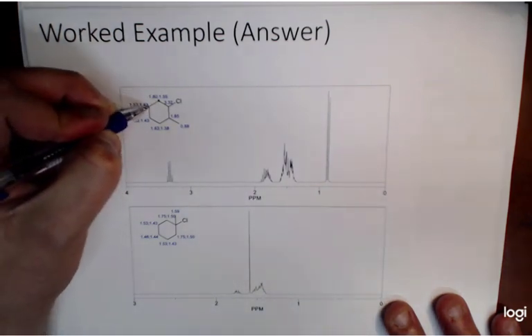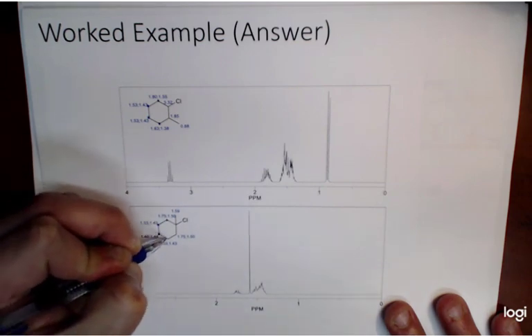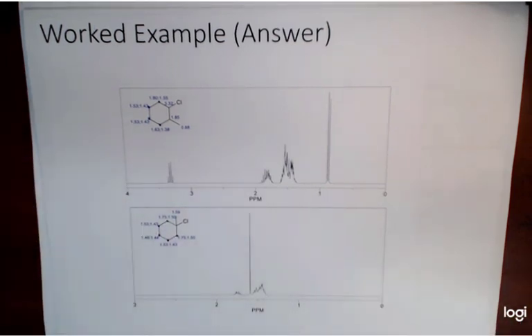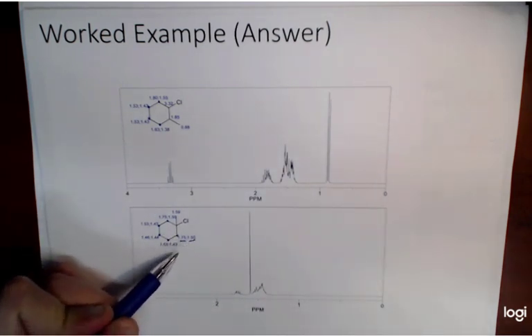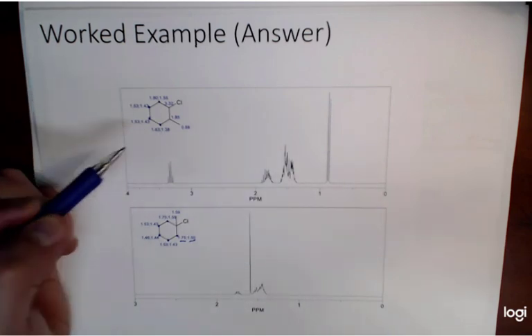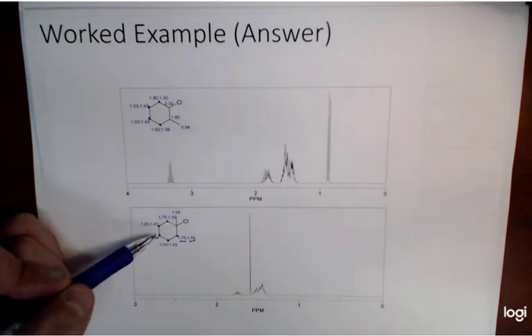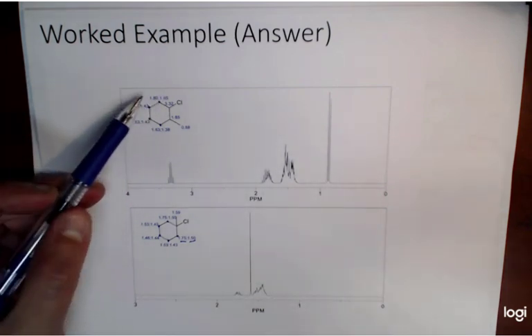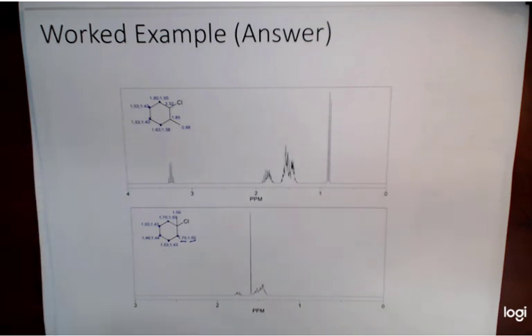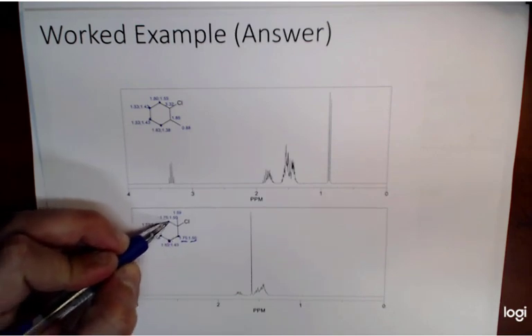What we would see here, big thing I want to point out, you'll notice that at each one of these carbon positions that has two hydrogens, each hydrogen has two different numbers, 1.75, 1.5, and like here it's 1.63, 1.38. That is because remember this is cyclohexane now. The pi bond's gone, so it's cyclohexane with an A, and so you have both axial and equatorial hydrogen positions. So that's why we see two different numbers per hydrogen. So the hydrogens at each carbon are no longer chemically equivalent.